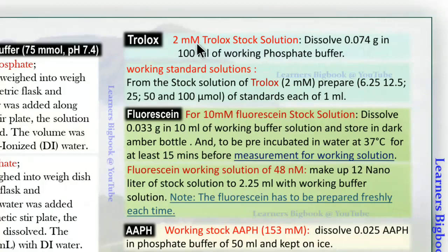Now further from this 2 millimolar Trolox standard, we are going to prepare working standard solutions of 6.25, 12.5, 25, 50 and 100 micromolar, each of 1 ml.